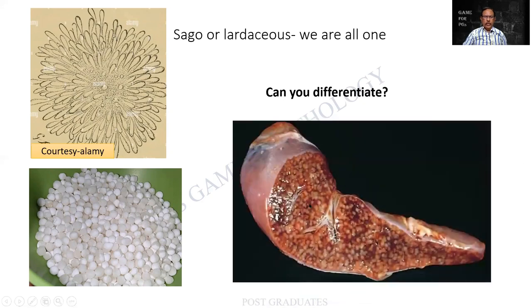And look at this over here. There are multiple nodules. You may get a specimen of the spleen. So again, the hilum is over here. There is a capsule. The cut surface is showing multiple small nodules uniformly distributed throughout. So what are all the differential diagnoses you can think of? Pause for a minute. See whether you are able to recollect the differential diagnosis. Tomorrow this might be a specimen. As I told you earlier, do not make a rare histological diagnosis on a gross specimen.